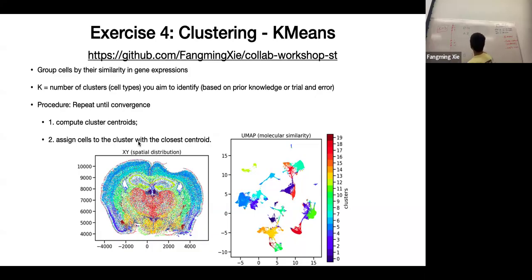In the first round, this 11 data point will be assigned to the square, and this 10 data point will be assigned to the square. This 9 is equal distance between these two, but just for the sake of randomness, let's assign it to the 8. It could be assigned to either one of them. That's the first one.